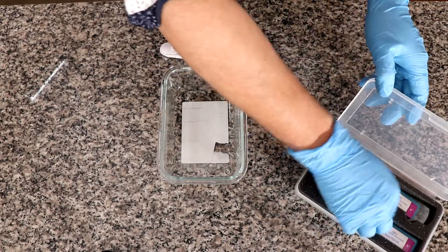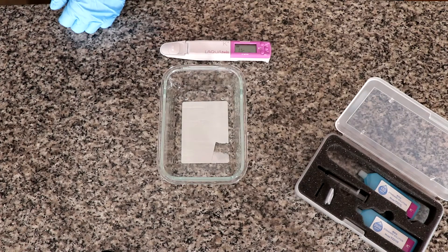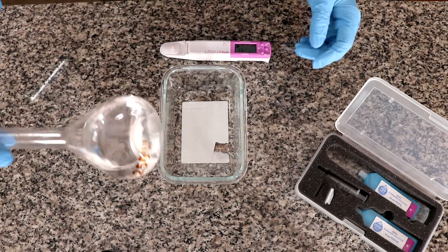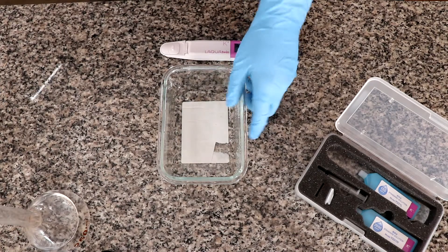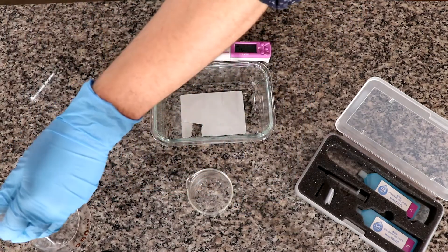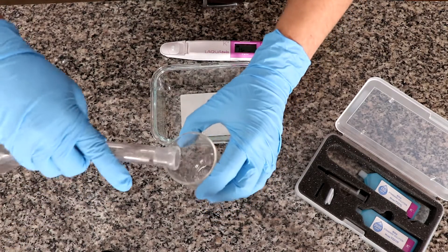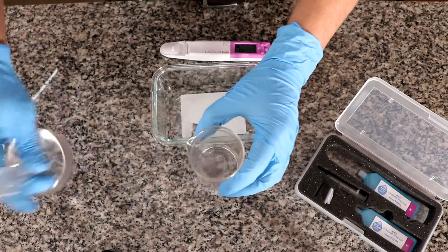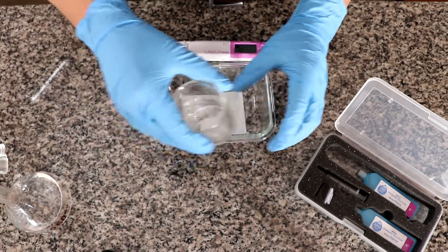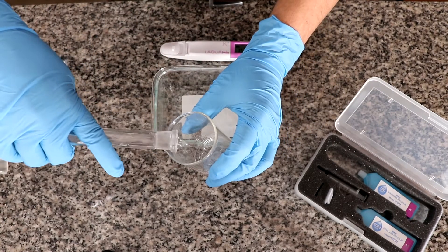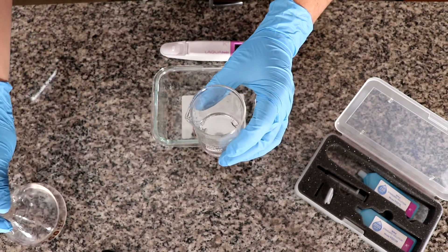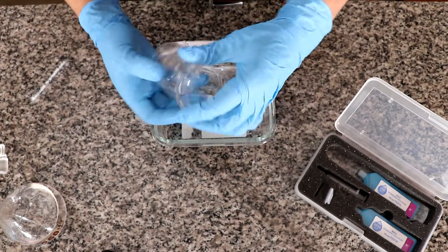Now we're going to put this calibration solution away and we're going to measure a problem solution. So we have here a solution that I prepared from a hydroponic fertilizer. Now I'm going to measure its potassium concentration. In theory it should be around 85 ppm according to the manufacturer.